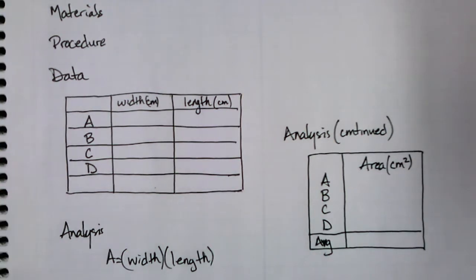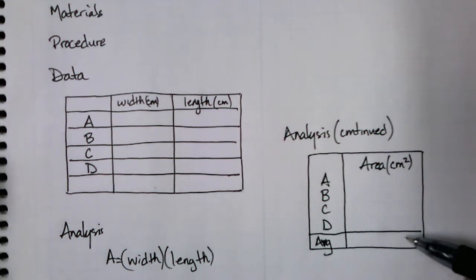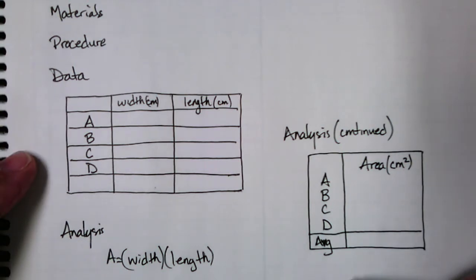Sometimes statistical analysis will be done on the information that you generate, and so you may need to incorporate lines for averages, perhaps medians, maybe a standard deviation, things like that. If we're working in chemistry or biology, and also maybe some of the physics, we may also be using some statistical software to analyze our data, and we'll be generating correlation factors or standard deviations and variances. So those would be things to note in your lab also.